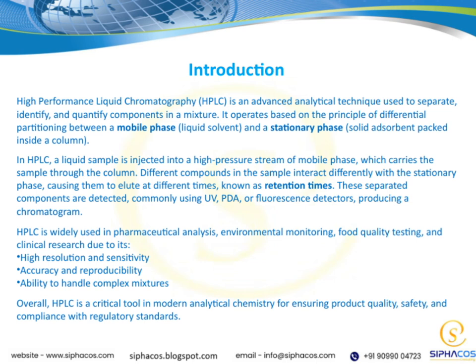Once separated, these compounds are detected using various detectors, such as UV, PDA, or fluorescence detectors. The signals from these detectors are then translated into a chromatogram, which visually represents the separation.